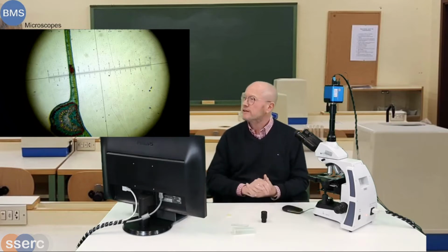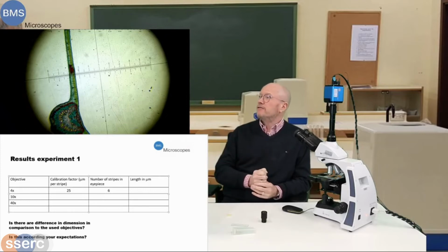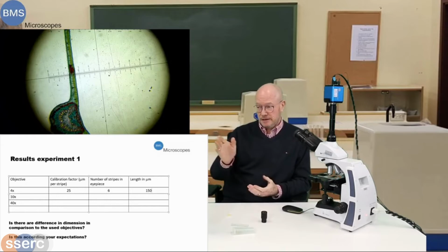Let's make a note of that. At the 4 times, the calibration factor that we found in our calibration table was 25. The number of stripes in the eyepiece now is 6. Each stripe equals 25 micrometers. So 6 times 25 is altogether 150 micrometers. That's what we've just measured.